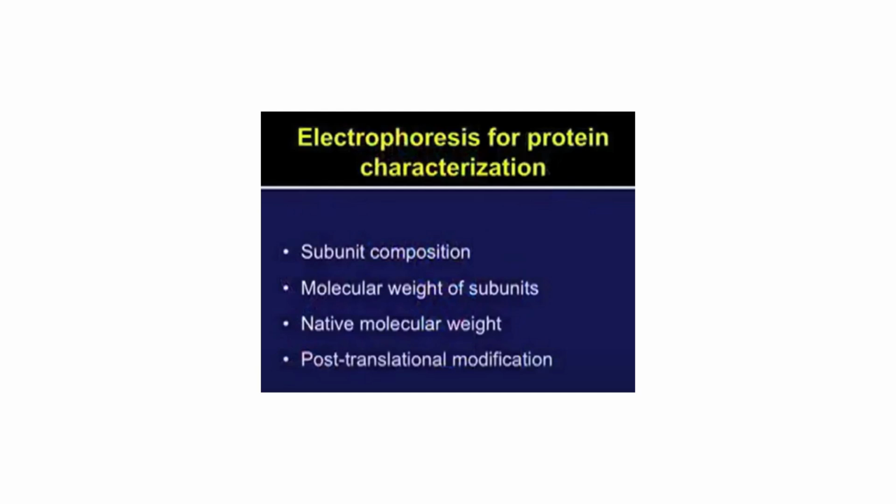For the disulfide bonds, you use DTT or beta-mercaptoethanol while doing the sample preparation. That will cleave the disulfide bonds and make the protein linear. Now you can run the SDS-PAGE gel. So how exactly is it made? You need polyacrylamide, TEMED, APS, which is ammonium persulfate, and buffers. TEMED helps in initiating the reaction, and APS will do the cross-linking of the polyacrylamide gel, making it solidified.